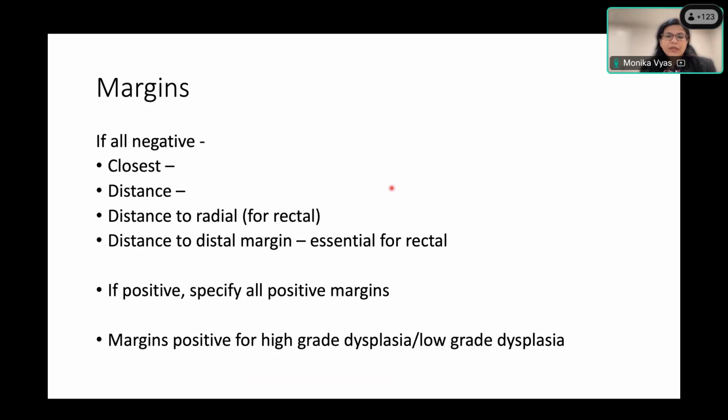For rectal cancers, we follow a 4-color ink protocol, which helps us identify ink colors and orient ourselves to which margin is closest or positive. But you can either do it that way, or you can have a clear section key specifying which sections are taken from which part, and that way you don't have to ink the specimen wholly. So you can have an approach which works best with your trainees and labs.